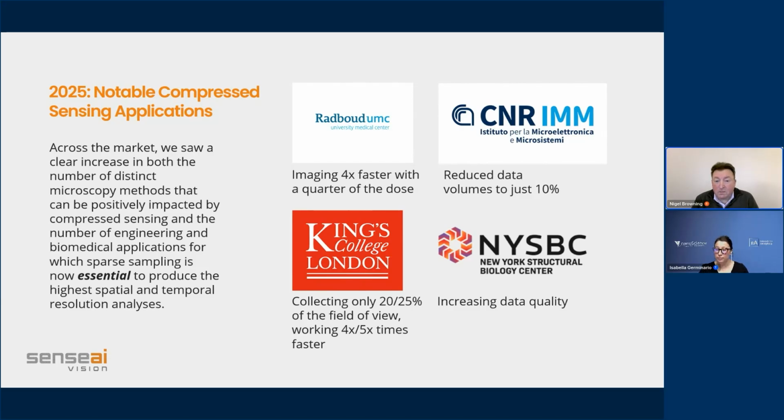And then most recently, NYSBC are looking at both the 4D STEM and also the volume imaging side of things to really improve the quality of the data that comes out on the structural biology side.